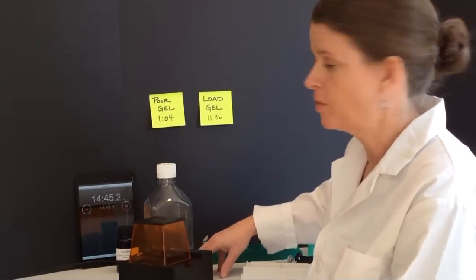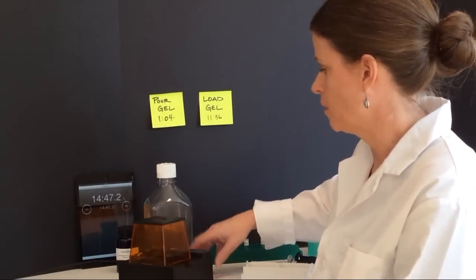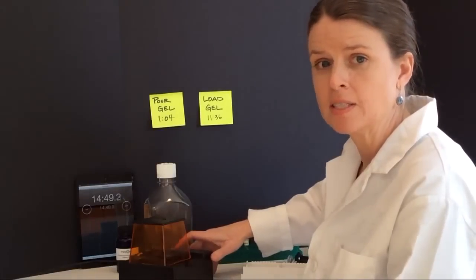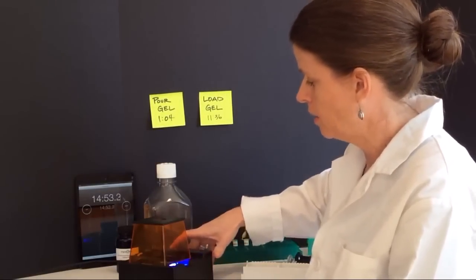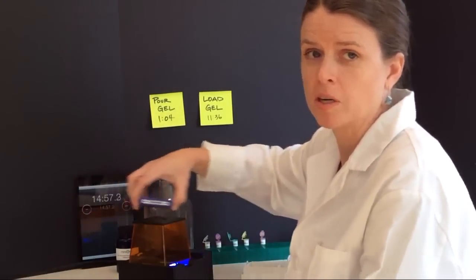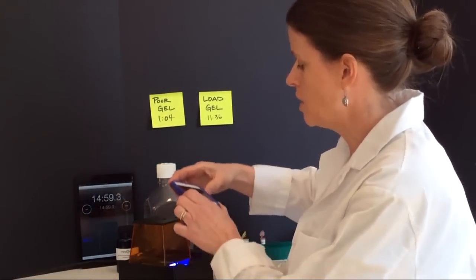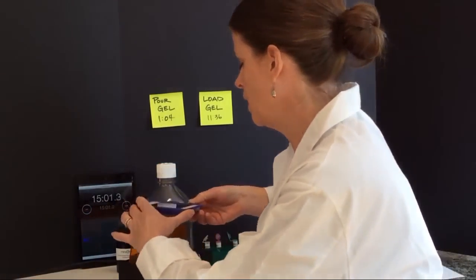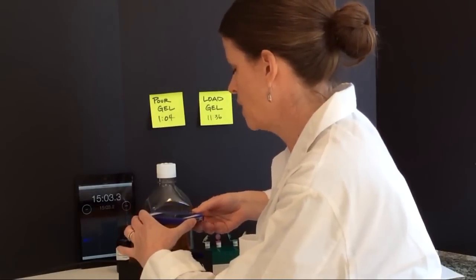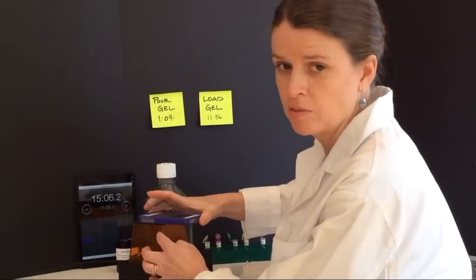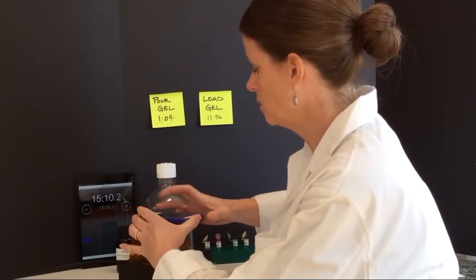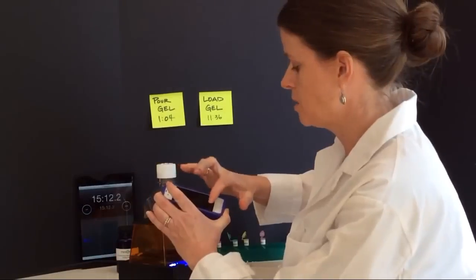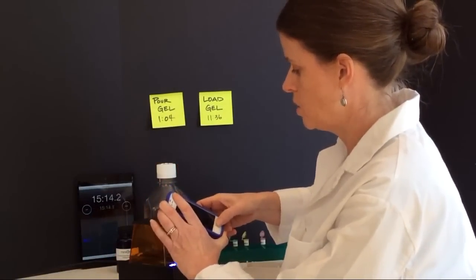Our gel's been running for only about three minutes now, but already I can see some movement of the DNA. If I turn on my highlight here, remember this is just a blue light, there's no UV light to worry about. I can use a mobile device or a camera, and because this has been designed so that it's a perfect focal length to get a good image of my gel, I can take a picture to document the movement of the gel.